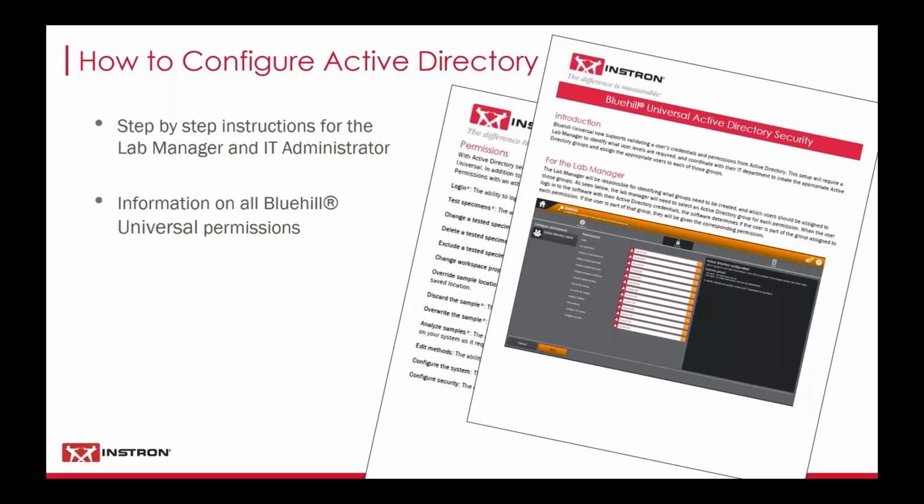You can also contact your field applications or sales representative for this information, and we'll also supply it as a handout at the end of this webinar. And this document is really important because if you are planning on using Active Directory, you need to make sure that you've gone through the proper precautions with your IT group in giving your users permissions, so you can just set that up once.